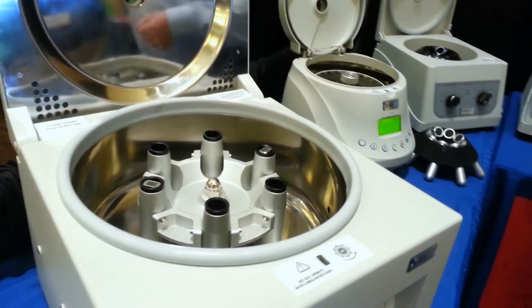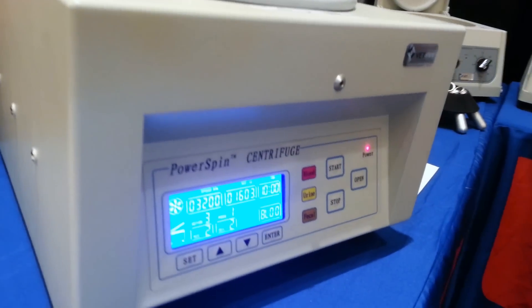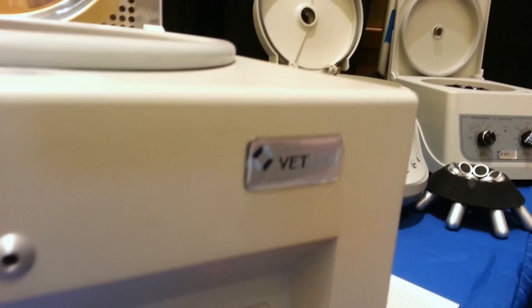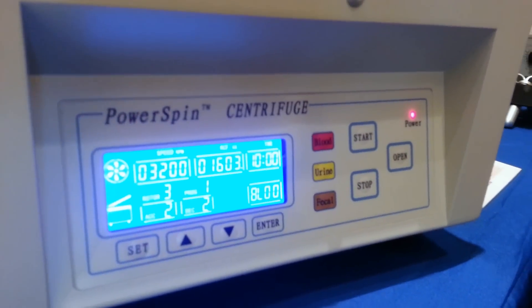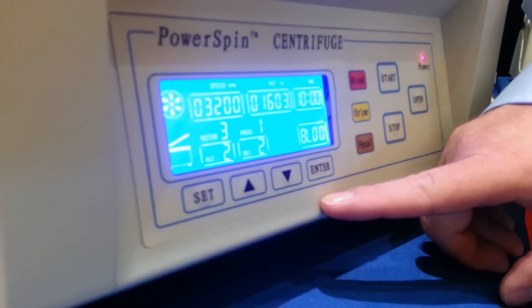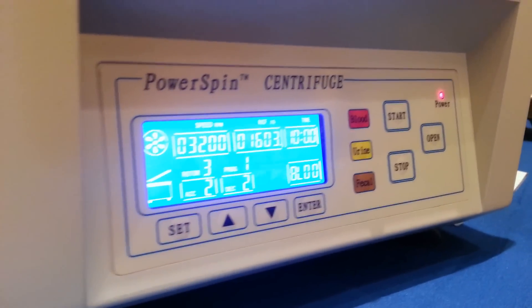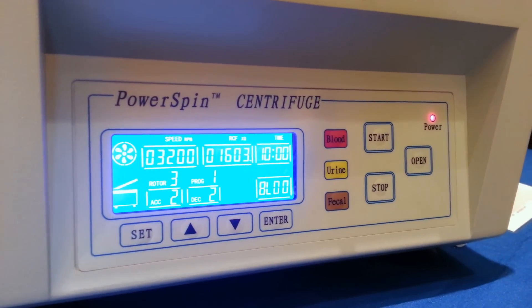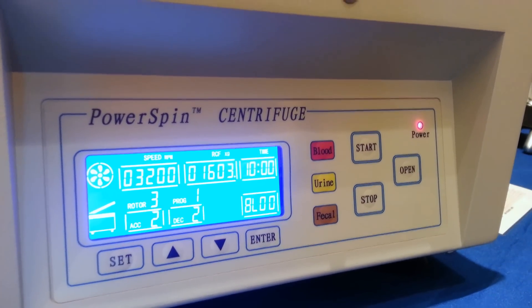This design is in response to the MWI equipment team and some of the customers asking for things to be a little more simplified. These different specimens are pre-set, but you also have controls for setting any run time or speed that you want if you want to do a different type of run. So it's a very versatile centrifuge — it will do just about everything that a customer would want to do.